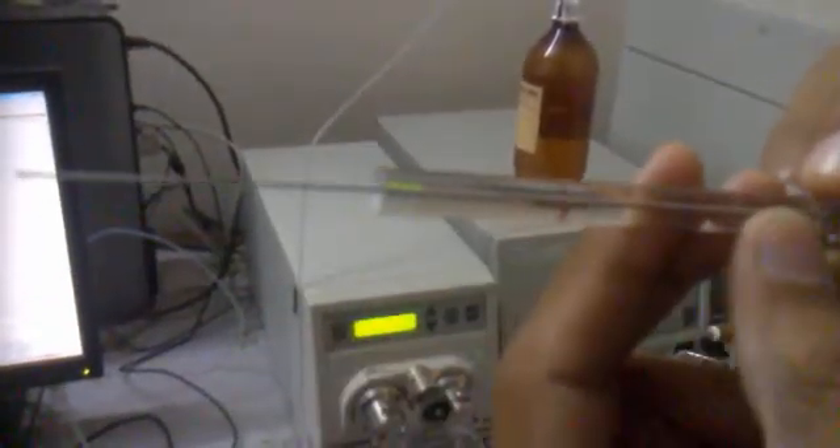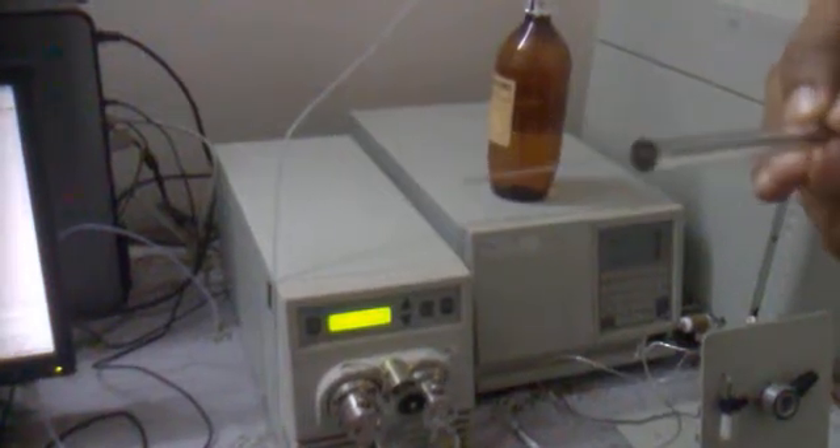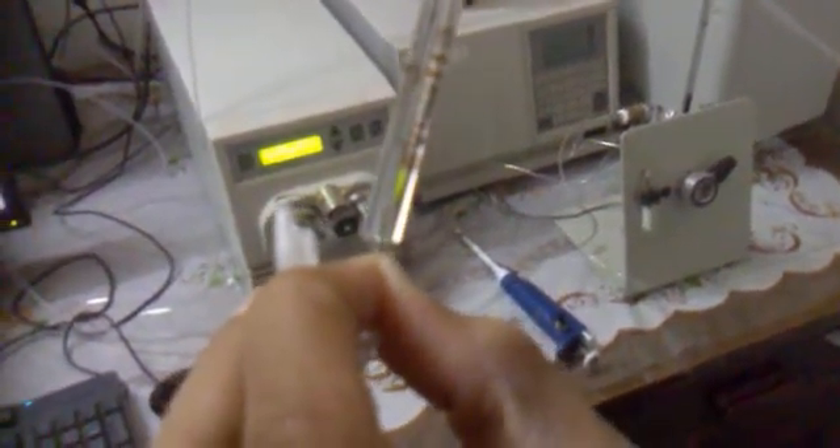This is the Hamilton syringe. It has a capacity of 25 microliters to inject at once. We will take the sample — the sample should be drawn such that there is no air bubble into the syringe.